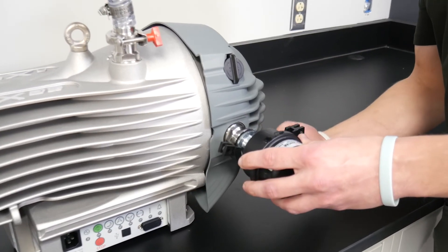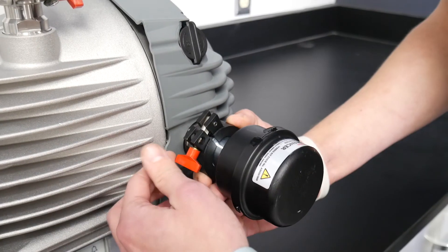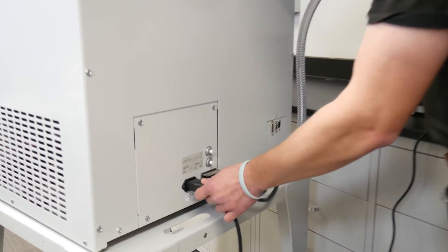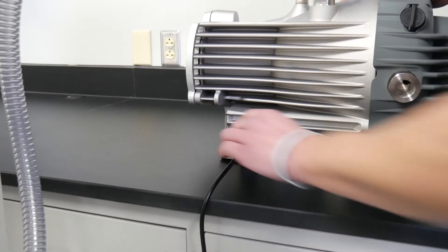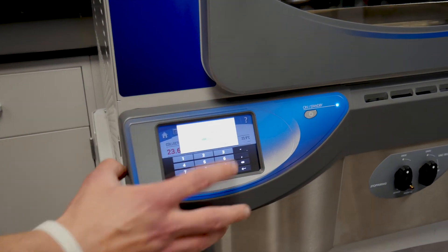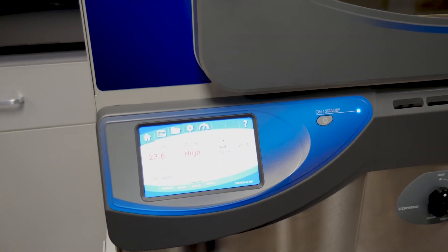If you've purchased the optional silencer for this unit, you can install it now. Attach the power adapter to your FreeZone or CentriVap and the vacuum pump, then press vacuum on your freeze dryer or CentriVap to activate the vacuum pump.